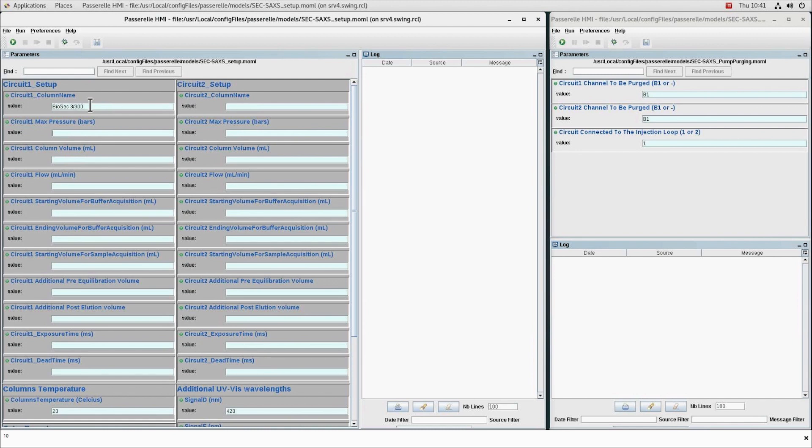If this value is reached, the system will stop automatically. The total volume of the column, the working elution flow rate.